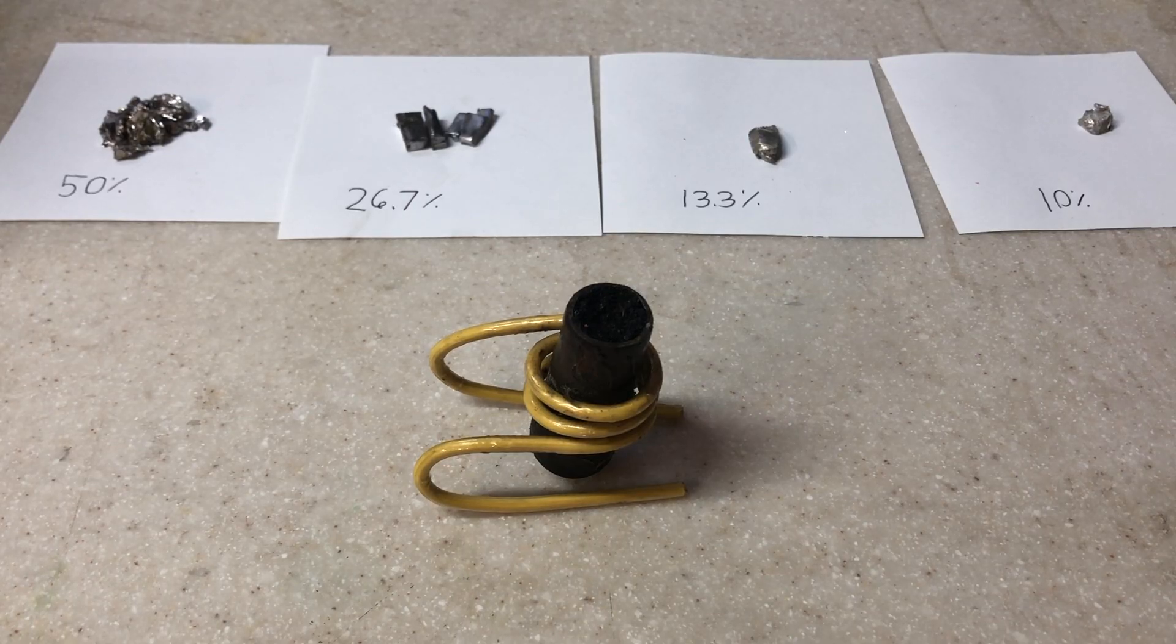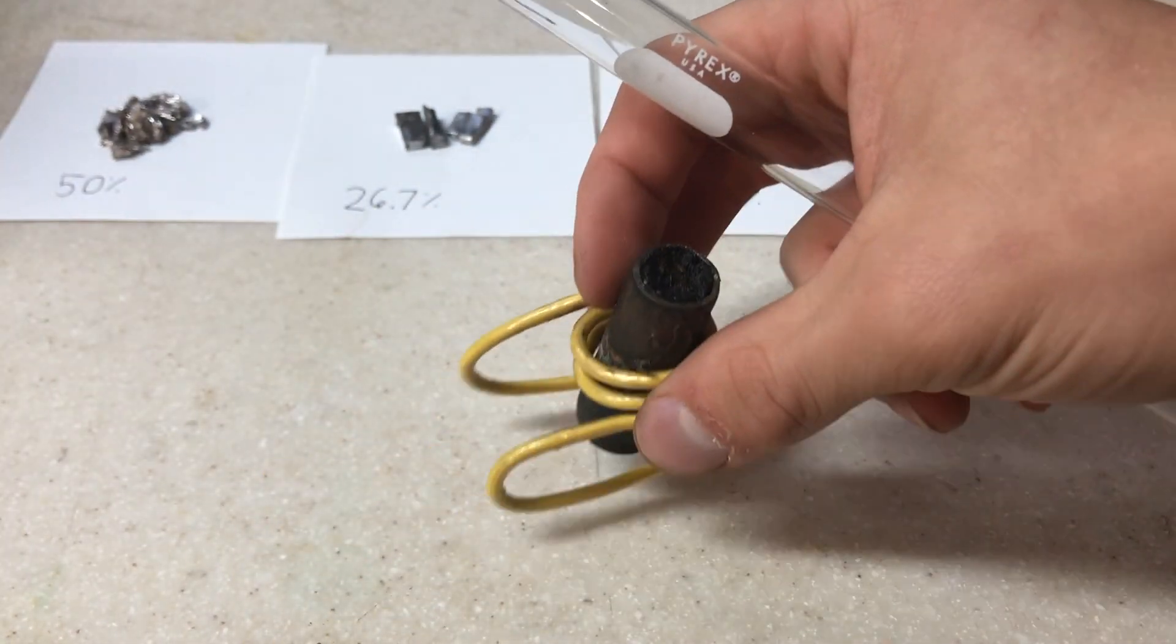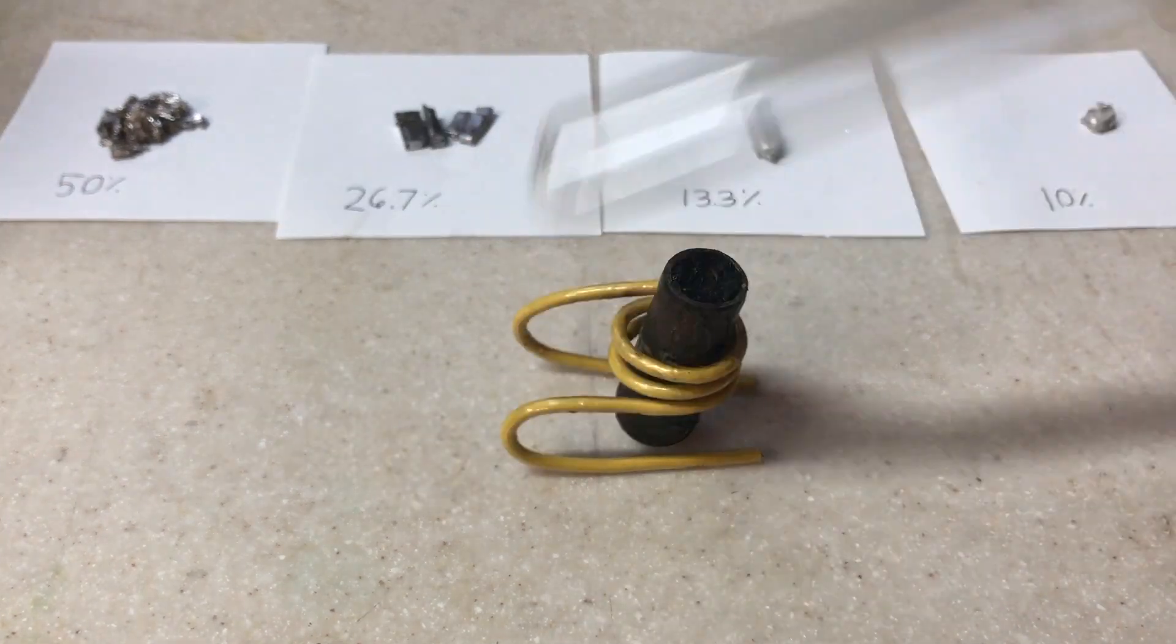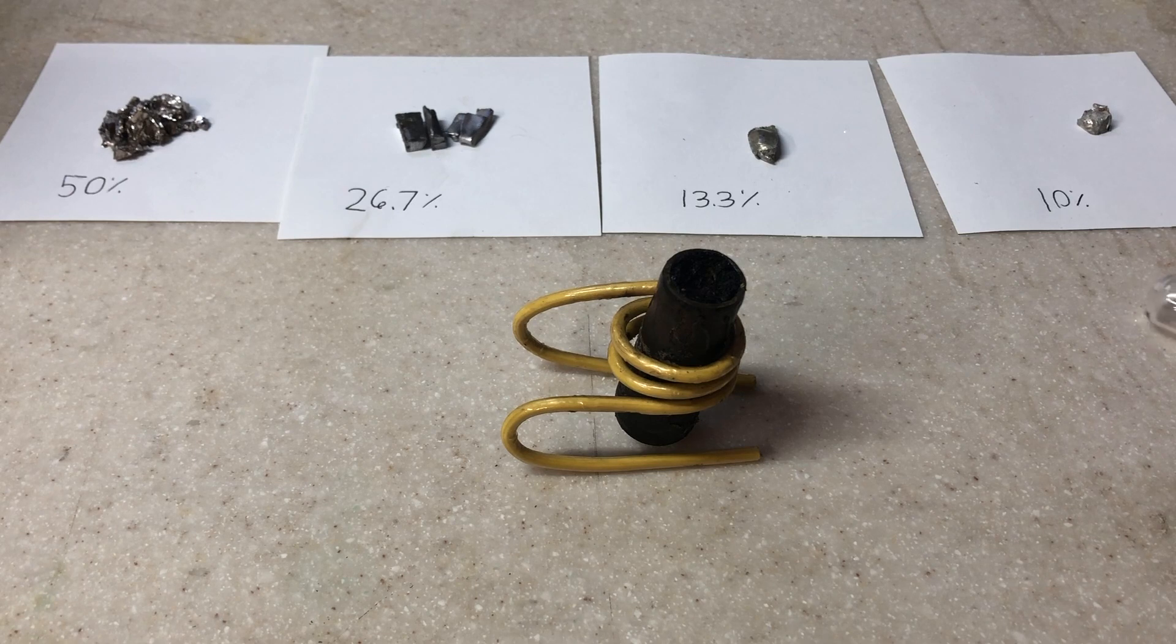To melt and make the alloy, I'm going to use a denatured alcohol torch and a glass test tube. I'll drop each element in and heat them up until they melt and form the alloy.